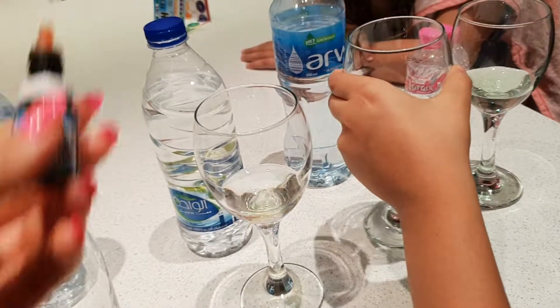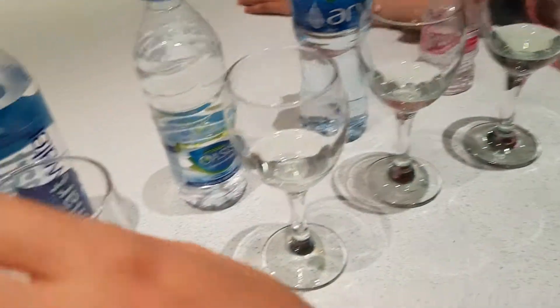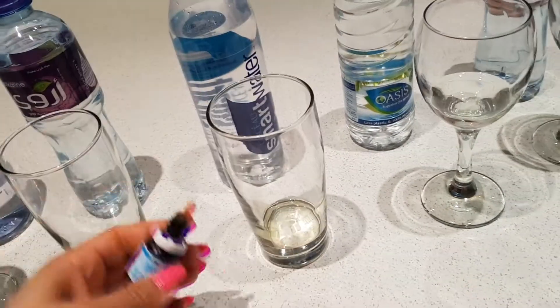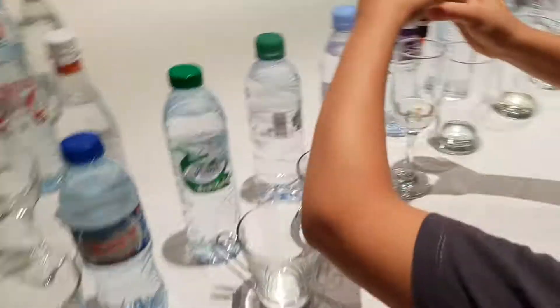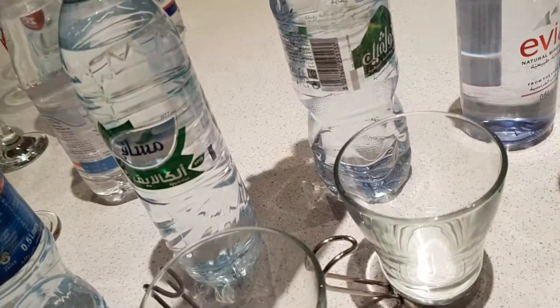So compare it to the chart. What we'll do is repeat Oasis to be fair, because I think I put more than four drops. So we'll repeat Oasis — in the meantime we're doing the others.